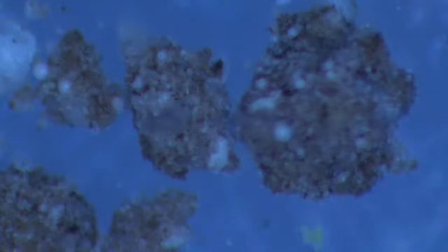Basically you have this little metal wire with a loop on it, and you inoculate. You touch the area with a wet wire just to pick up a sample, and then you inoculate the agar plate, and then you give it a warm environment for about a week or so, and pretty soon you have a nice colony grown in the petri dish of whatever it is. And if you carefully place it along the petri dish in little sections, you can have little different colonies from different things.